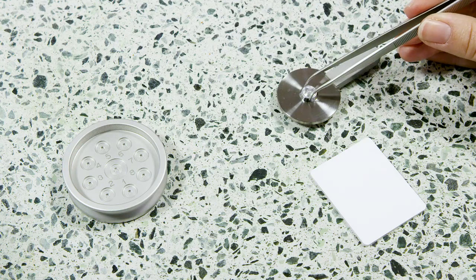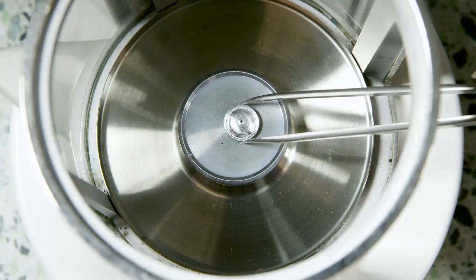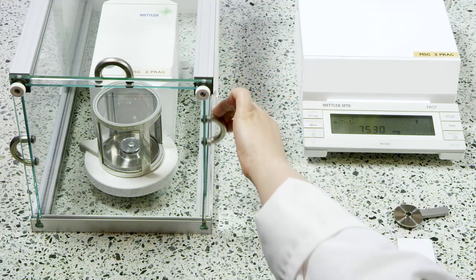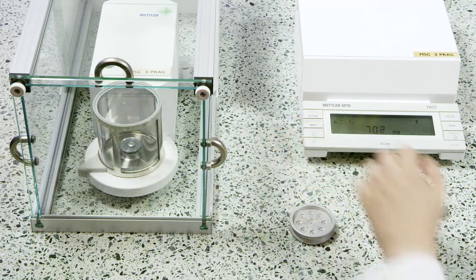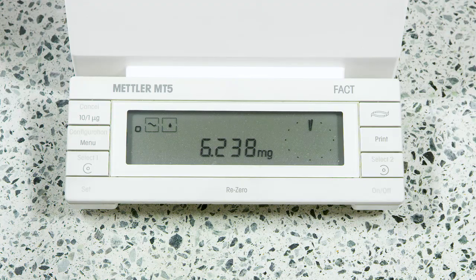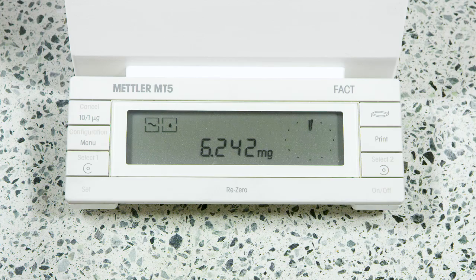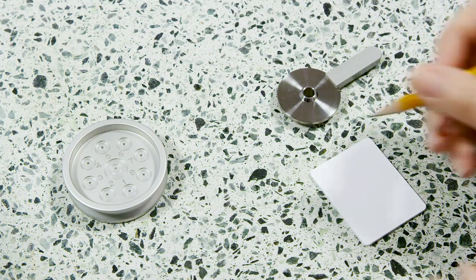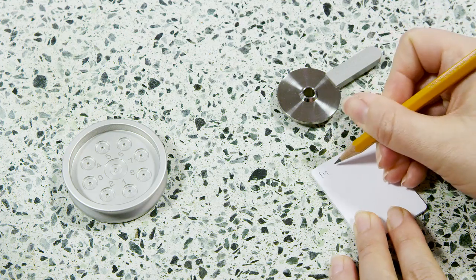Transfer the closed crucible back to the balance. Close the weighing compartment and let the balance stabilize. Read the weight displayed on the balance terminal and note it down on the whiteboard of the calibration box.